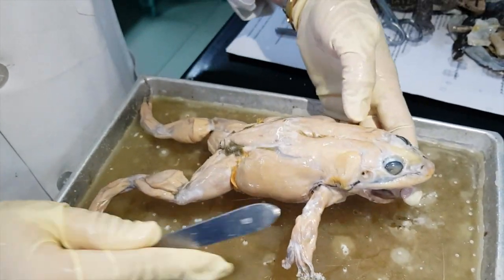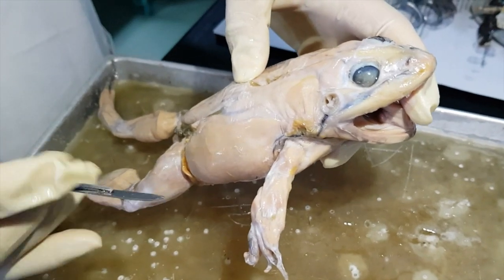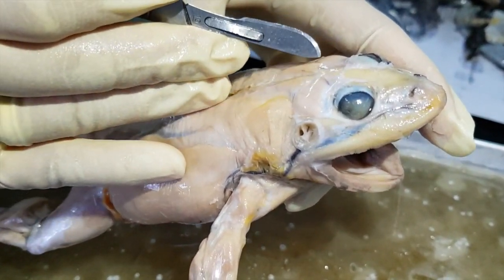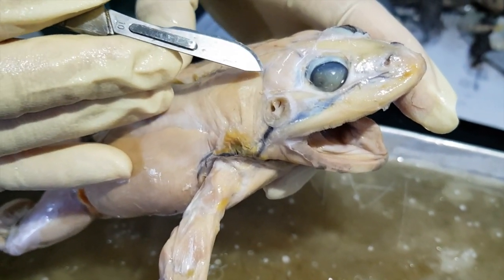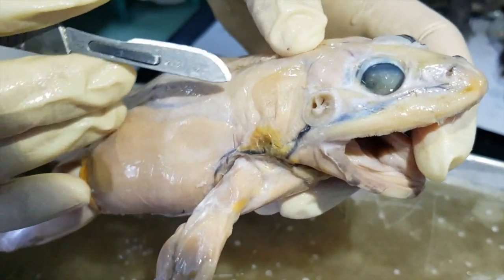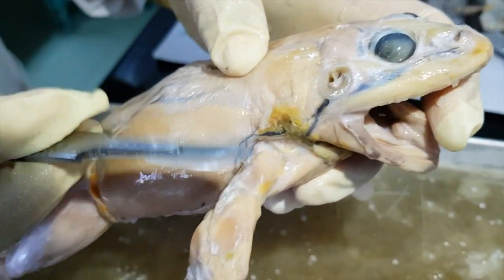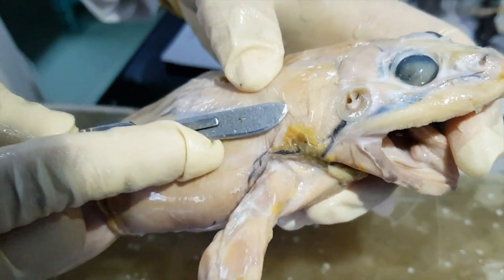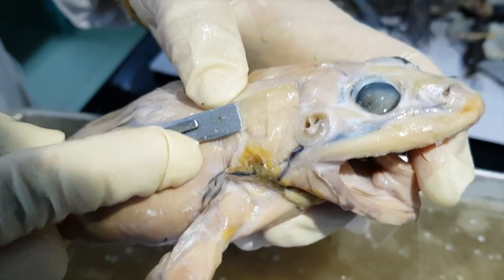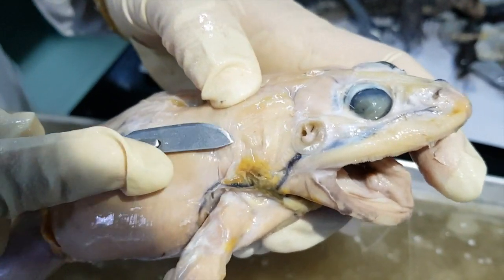Okay, so we'll start with the back muscles, dorsal side. In between the tympanum, there's this big muscle that covers the temporal bone. That's the temporalis muscle. Then as you go forward, there's this circular muscle that when you remove it, you deflect it from the deeper muscle to reveal another one.